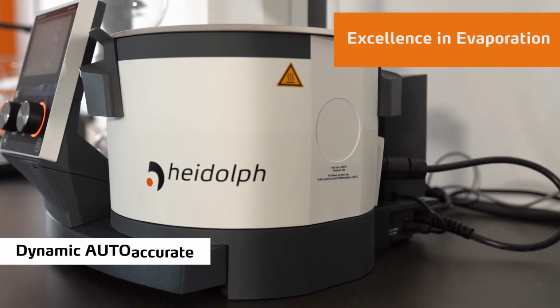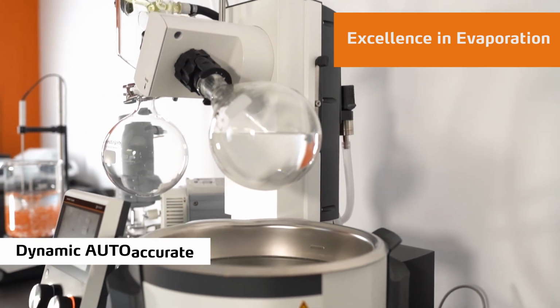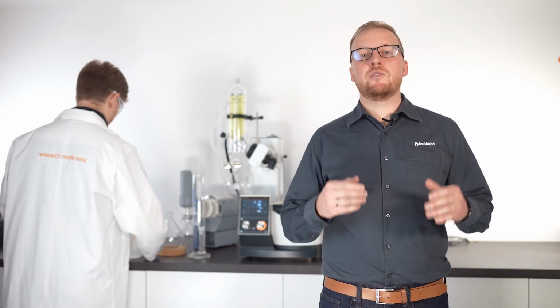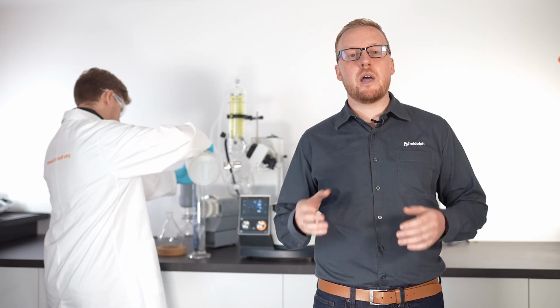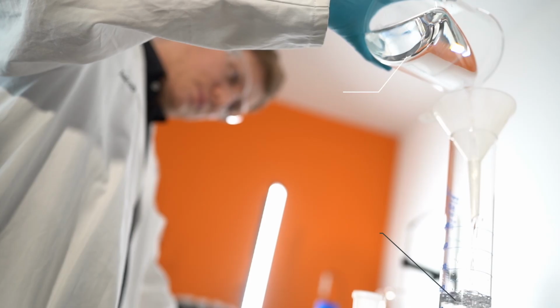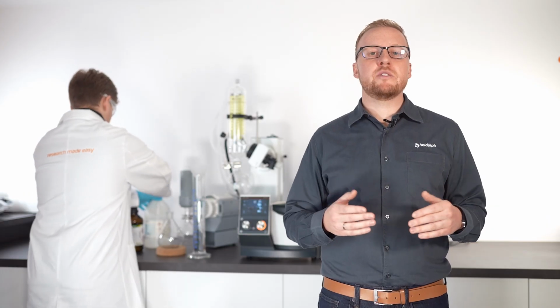Today we want to introduce a smart feature to automate some of the most relevant process steps of rotary evaporation processes. The Dynamic AUTOaccurate, or short DAA mode, is a smart program to detect and address a single or even multiple boiling points automatically. In this video we will show you how this feature can boost the efficiency in your lab, can avoid undesirable side effects like foaming or bumping, and how it can ensure a stable, constant evaporation without readjustments or monitoring.